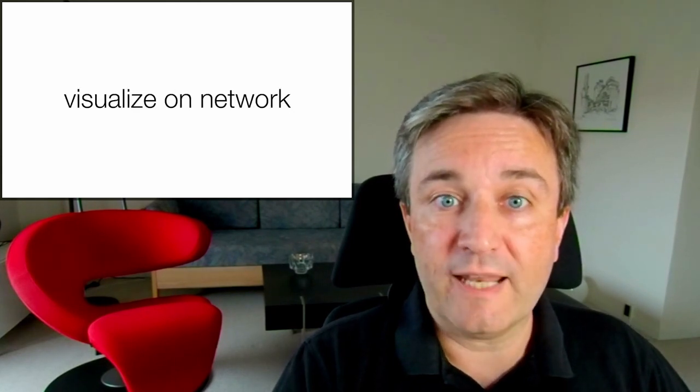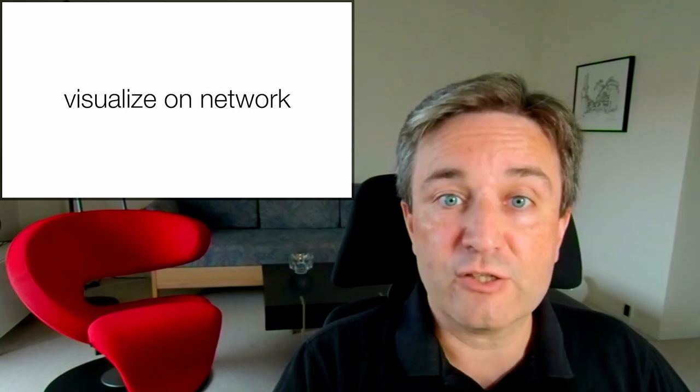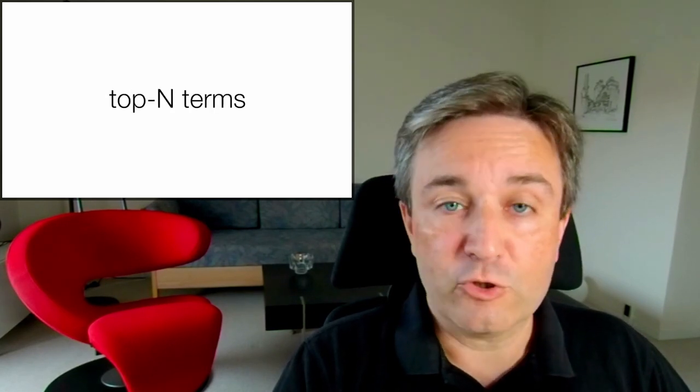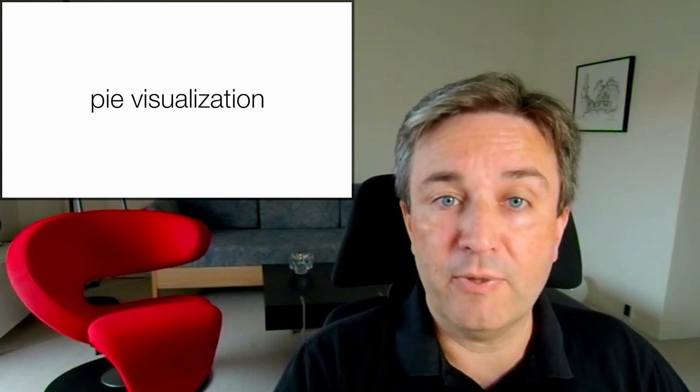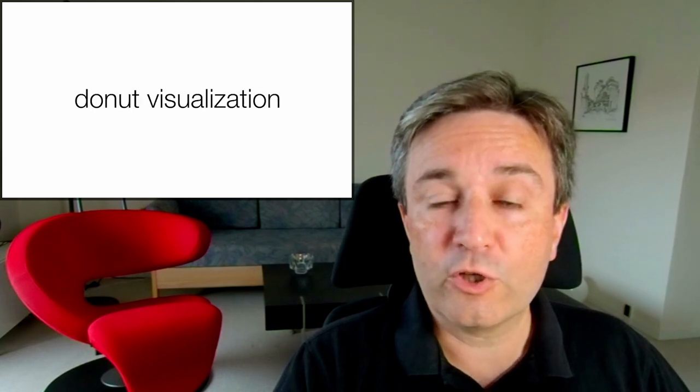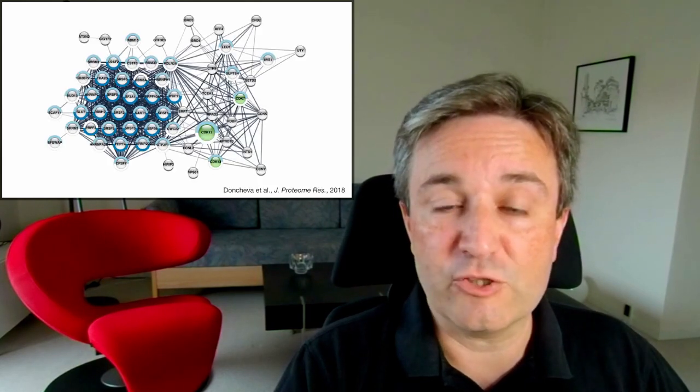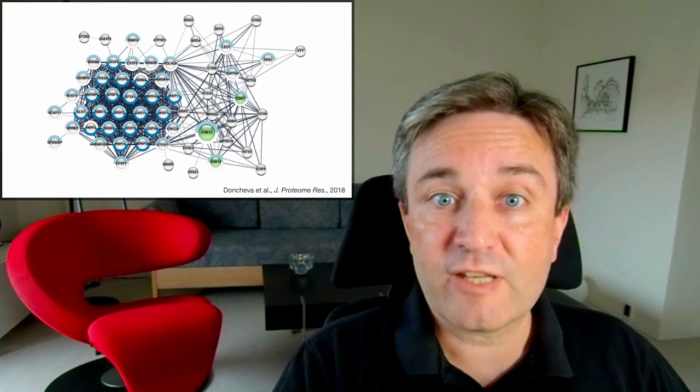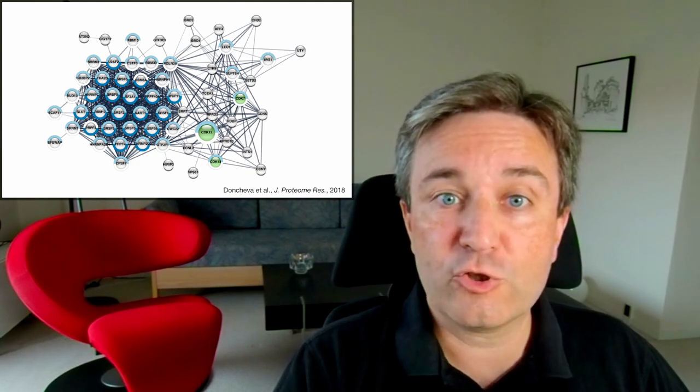Once you are happy with your selection of terms, you can visualize them on the network showing the top terms either in a pie visualization or donut visualization like this. You can see in this case that two enriched terms are shown as the two halves of the circles around each node.